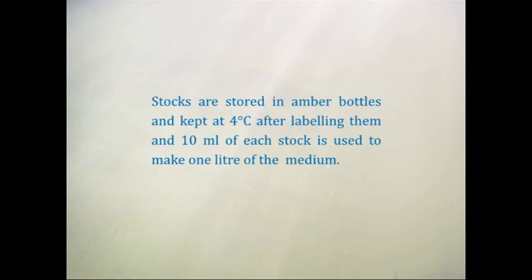Stocks are stored in amber bottles and kept at 4 degrees Celsius after labeling them, and 10 ml of each stock is used to make 1 liter of the medium.